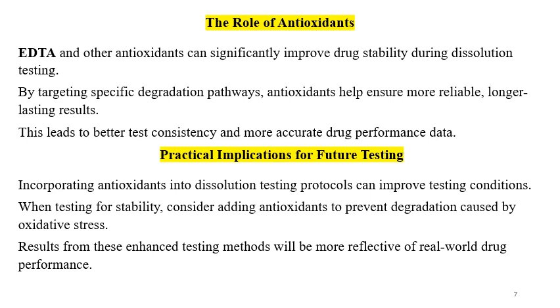EDTA and other antioxidants can improve the stability of API or drug substance in the dissolution media and can ensure more reliable dissolution results. When you are testing for stability, consider adding an antioxidant to prevent degradation caused by oxidative stress. Results from these enhanced testing methods will be more reflective of real-world drug performance.